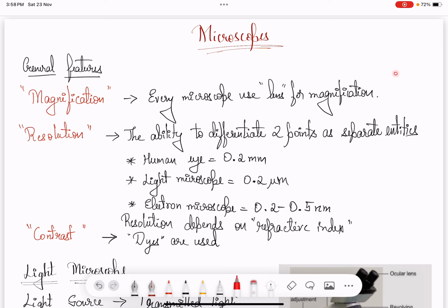Now coming into microorganisms, they are very small. The size of bacteria, fungi, parasites are measured nearly in micrometers. And coming into virus, they are still smaller and they are measured in nanometers. So, seeing these small microorganisms is nearly impossible for a naked eye. So, we need these microscopes.